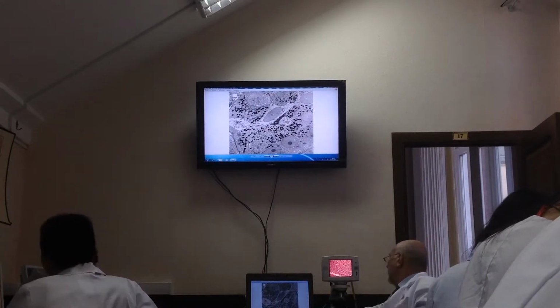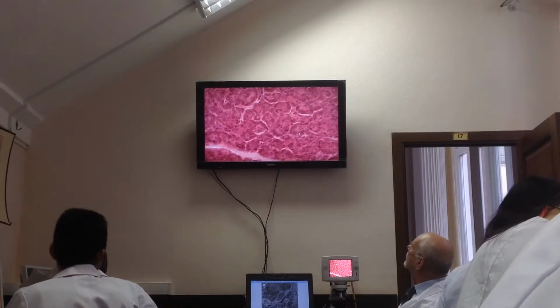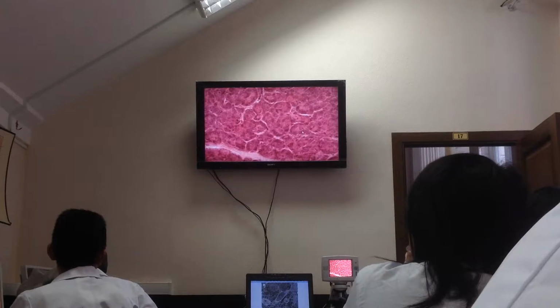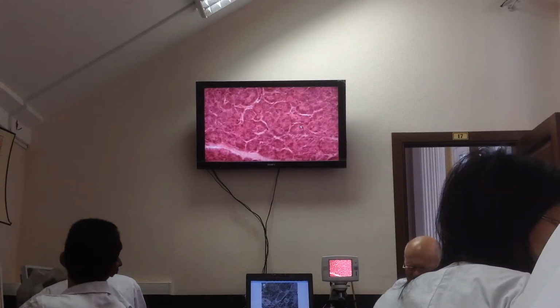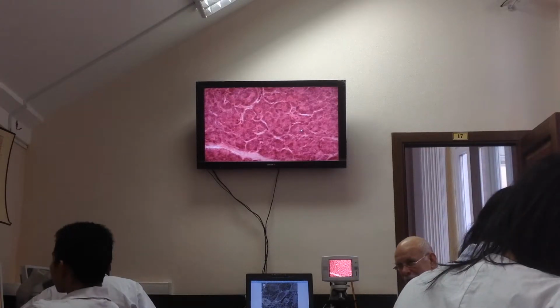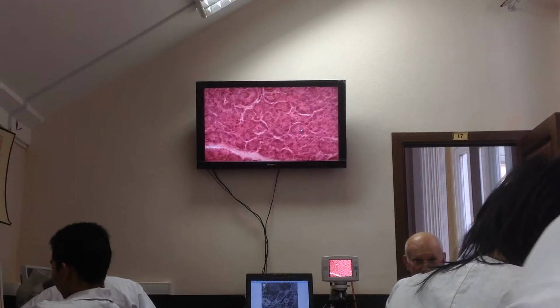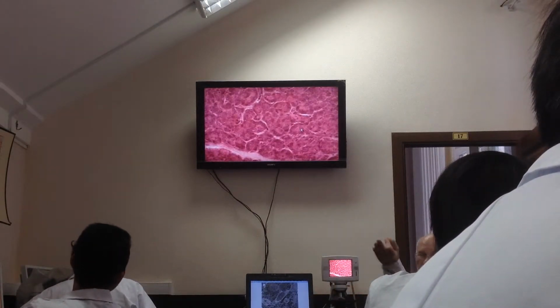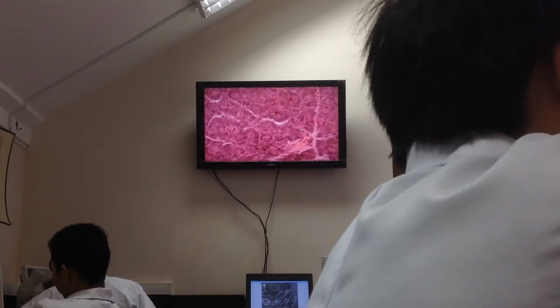Clear? Good. Now, in the slide, look, for example, this acinus. Do you see the nuclei? Peripheral position of the nuclei. So these are the nuclei of the acinous cells producing enzymes. But in the same acinus, you see two nuclei in the center. These nuclei belong to what cells? Cells of the intercalated duct. Is it clear? In what way can we find an intercalated duct? We can find centroacinous cells, which means you found an intercalated duct. Clear? Good. So this is the exocrine acini.